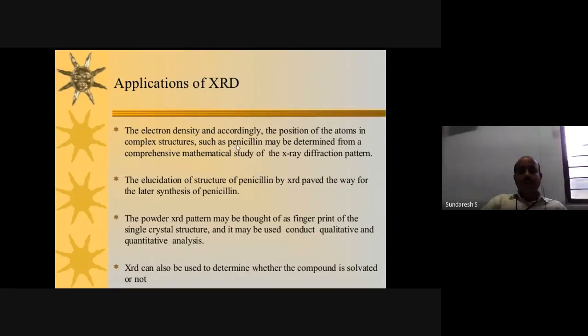See the structure of penicillin. We can have a comprehensive study of the structures, the electron density, and the position of atoms using this X-ray diffraction pattern. Then the elucidation of the structure of penicillin by XRD paved the way for later synthesis of penicillin.